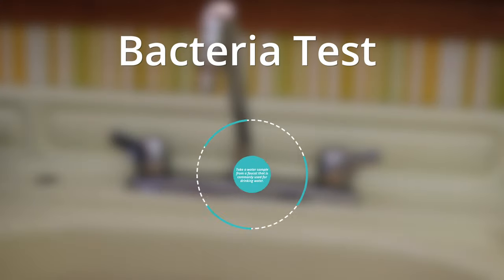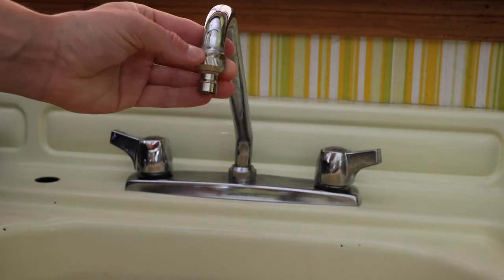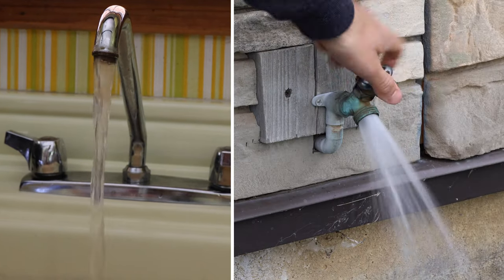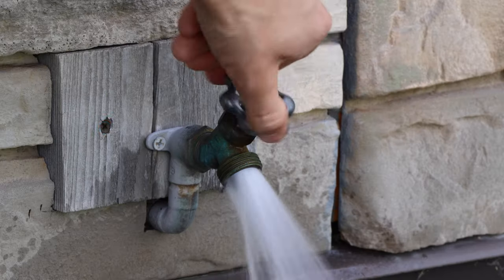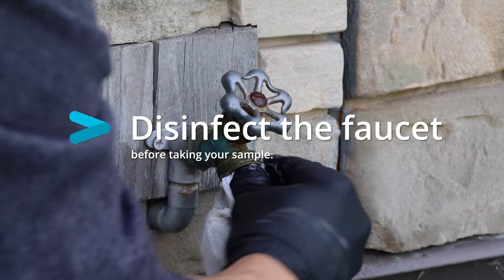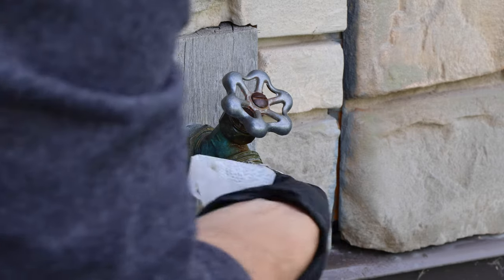For my bacteria test, I was advised to use my kitchen sink. It's okay if this sample has gone through a water treatment system. I will remove any attachments on the faucet before beginning. Then, the tap must run for 5 minutes before collecting a sample of water in order to flush it out. I also want to disinfect the tap prior to taking any samples. I'm using a medical grade disinfectant wipe, but a simple bleach solution will work well too.